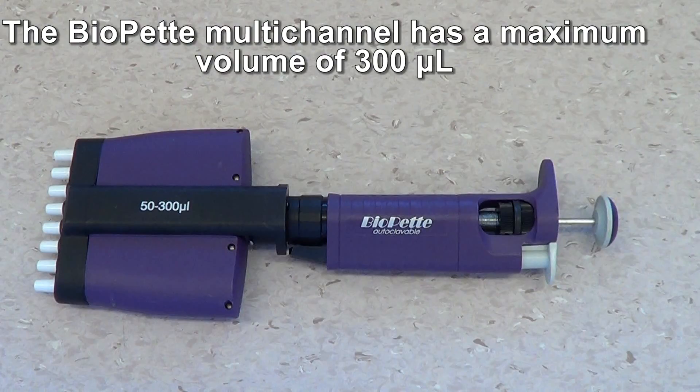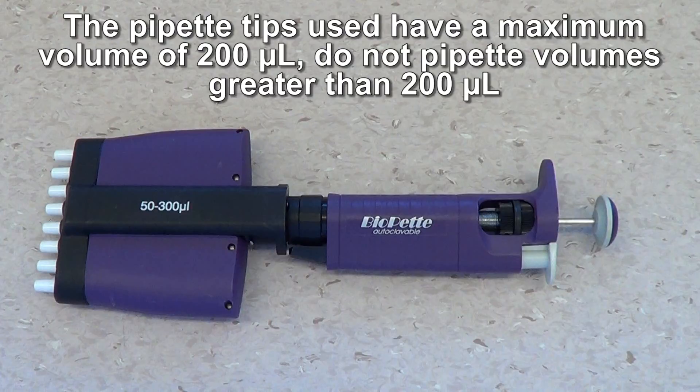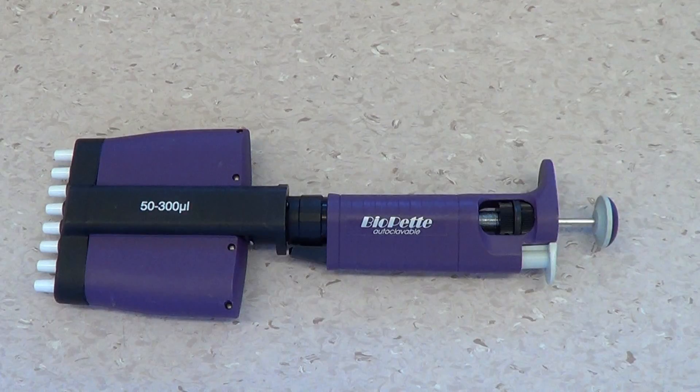The Biopet multi-channel functions similarly to the VWR, however it has a volume range of 50 to 300 microliters. The tips used in laboratory classes have a maximum volume of 200 microliters — do not set the pipette above 200 microliters.